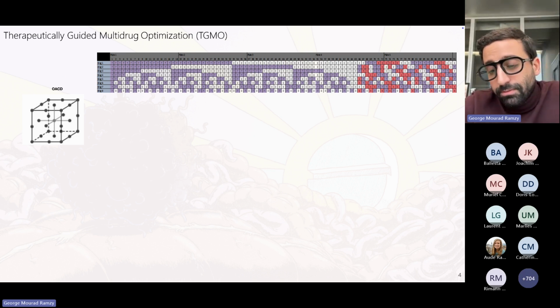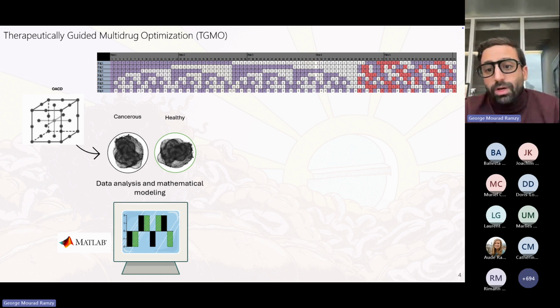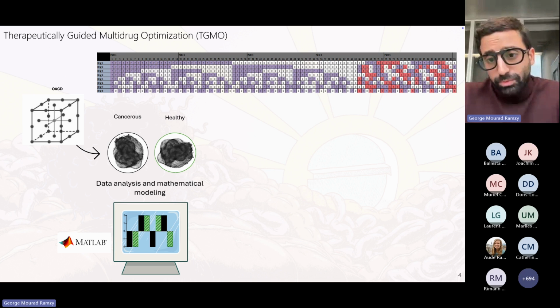The first half of the matrix actually exposes the linear effects of these drugs on a large experimental space, while the second part exposes how the effect of these drugs will vary at different dosage. So we start performing the drug screen simultaneously on cancer and healthy models to guarantee the selectivity of the final combination that we obtain.